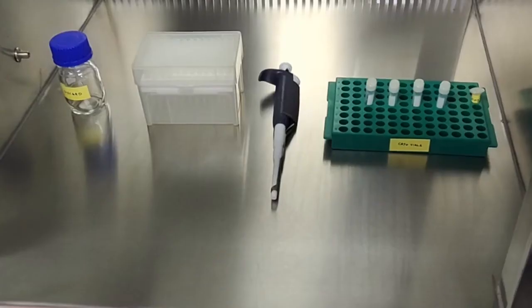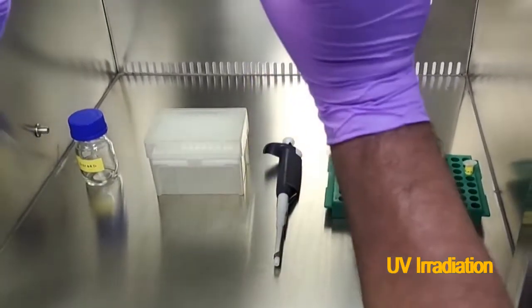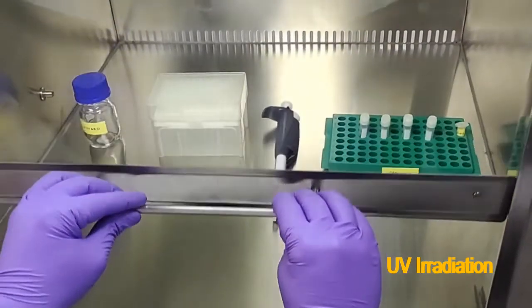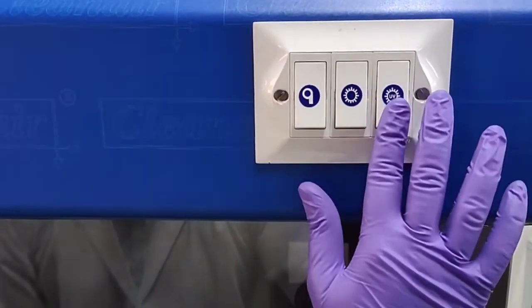Then we need to sterilize the chamber with UV radiation. We are switching on the UV with the tip box, the pipette and everything inside — cryovials, et cetera.